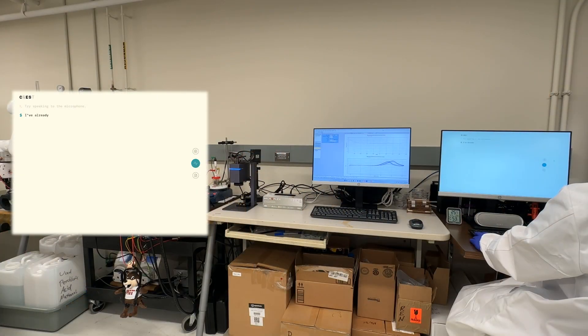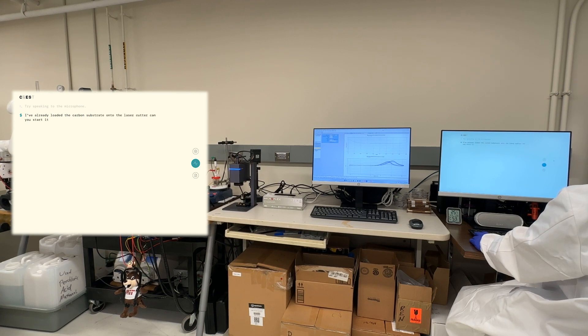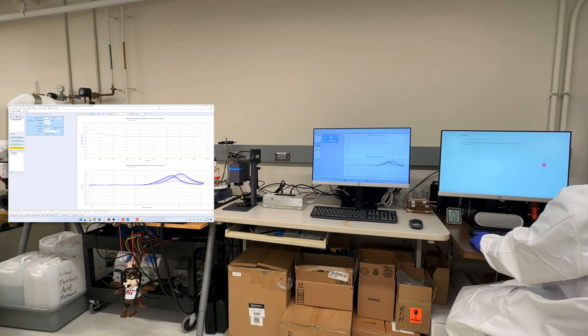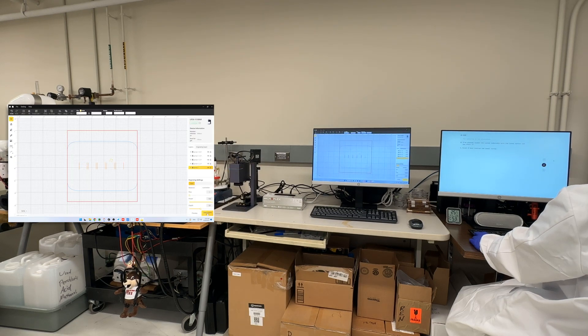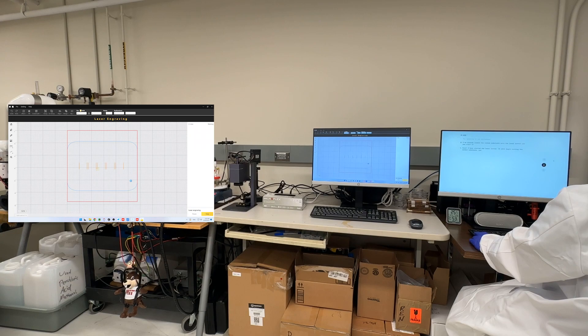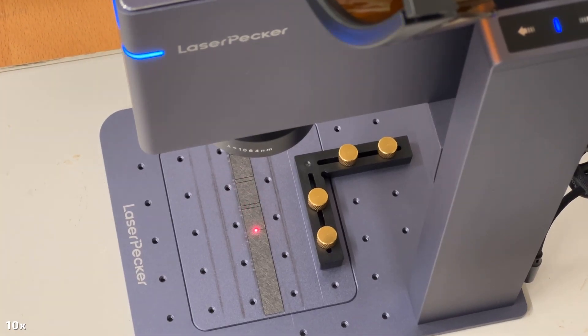I've already loaded carbon substrate onto the laser cutter. Can you start it? Sure. I have started the laser cutter. It will begin cutting the carbon substrate. Let me know if there is anything else I can assist you with.